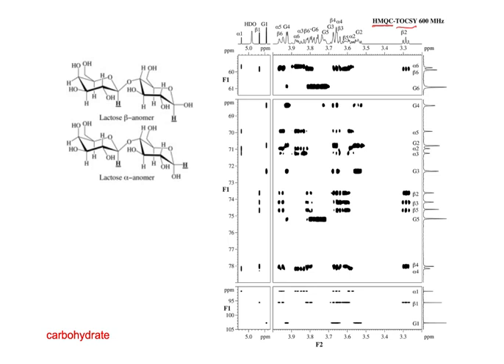But then from the proton, the signal can be relayed along the spin system, so we can see from a carbon to all the protons in the spin system. Or, I guess, from the proton to all the carbons in the spin system. So, for example, we could look at this in 2 different ways here.